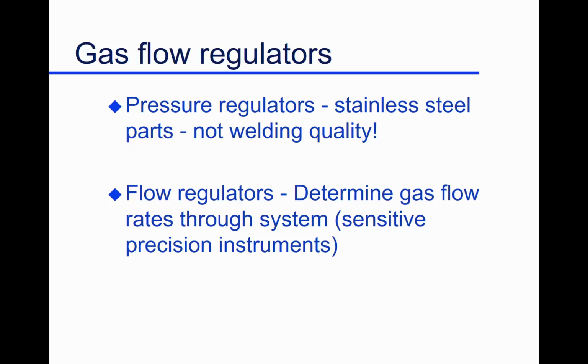Our gas flow regulators, well, they are pressure regulators. And again, not welding quality. They're all stainless steel. The gas chromatograph is measuring things in the nanogram, femtogram range. A few femtograms, and you're going to see a peak. So if you're dealing with low quality regulators, there are membranes in there, rubber seals, and so on. They're going to have enough contamination coming off all the time to always give you a chromatogram, whether you put a sample in or not. Needless to say, it creates some issues. So you buy a good quality regulator too. Good quality gases, good quality regulators.